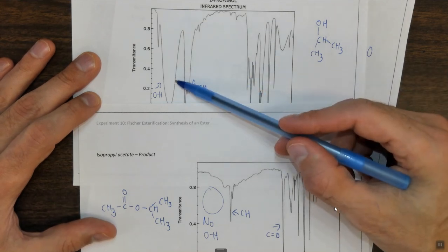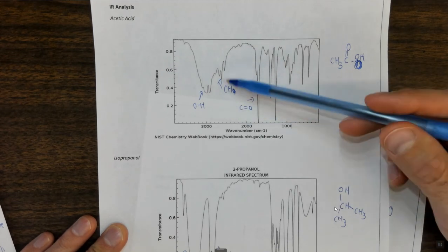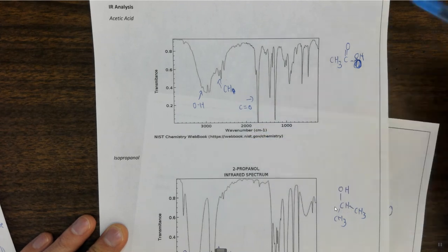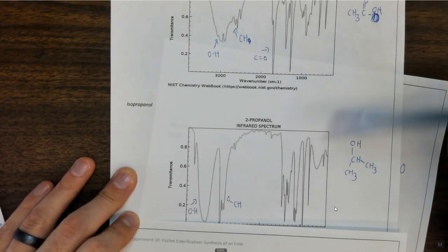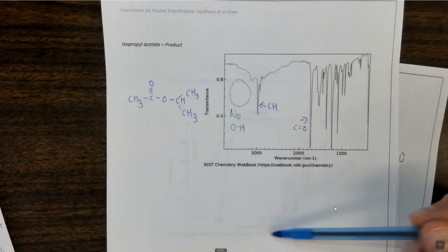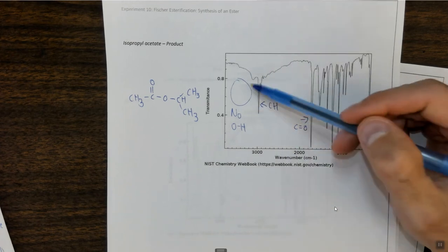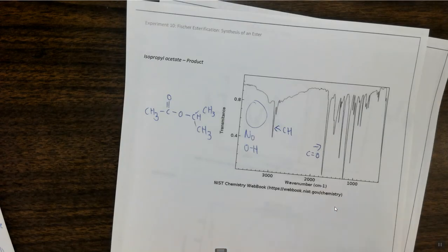Also, a good reason it's not acetic acid is, one, because we worked it up with sodium bicarbonate, so if we did that properly, it's pretty much impossible. The other reason is the boiling point of this is very, very far different from the boiling point of our actual product, but you can also identify it by the IR as well. Note that the way we made this, including the distillation, we didn't recently interact it with a protic solvent. The lack of OH is a pretty good indicator that the molecule has been converted, and it's also fairly likely to occur because we're not going to have other sources of OH readily available to contaminate our results.